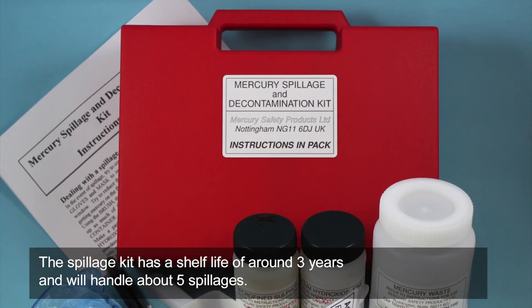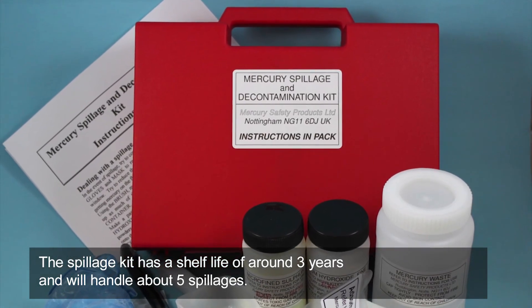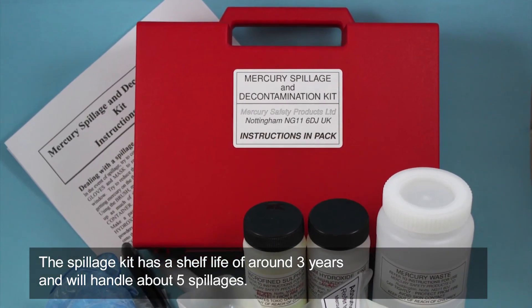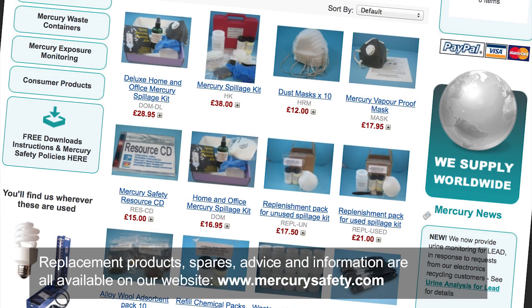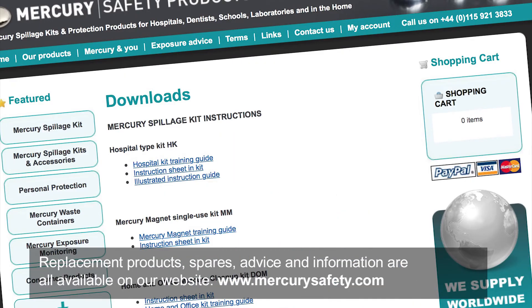The spillage kit has a shelf life of around three years and will handle about five spillages. Replacement products, spares, advice and information are all available on our website mercurysafety.com.